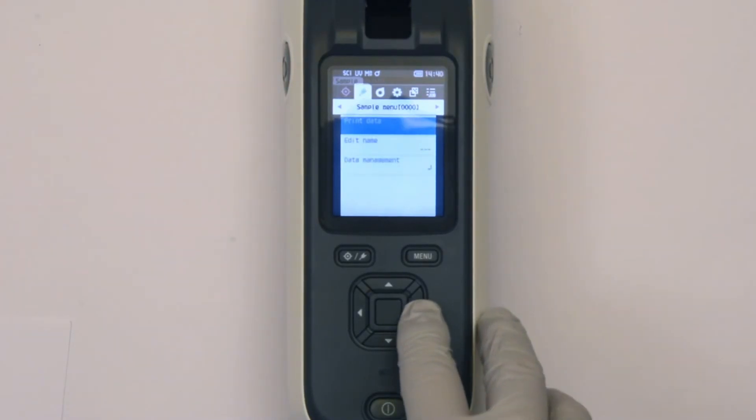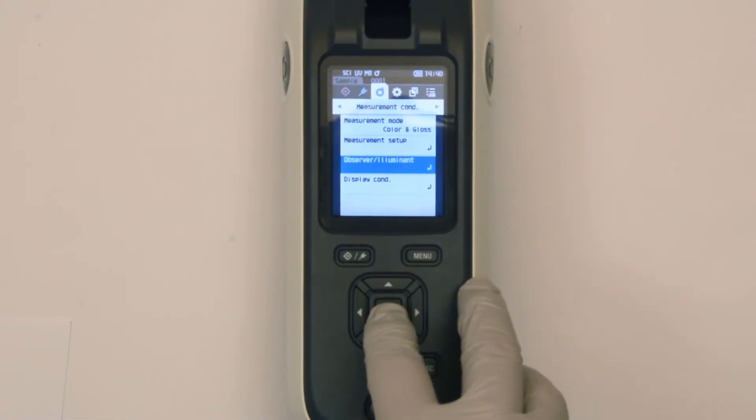It is also very easy to change the displayed color equations, illuminant, and standard observer.